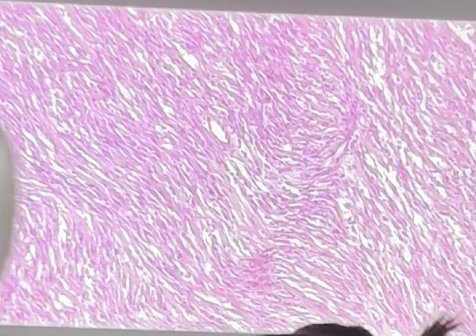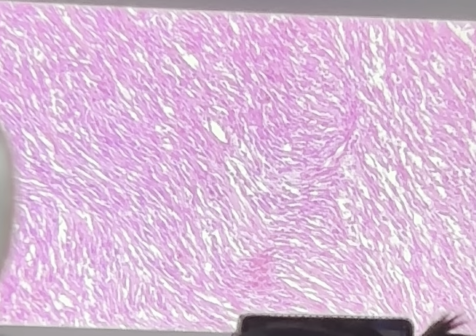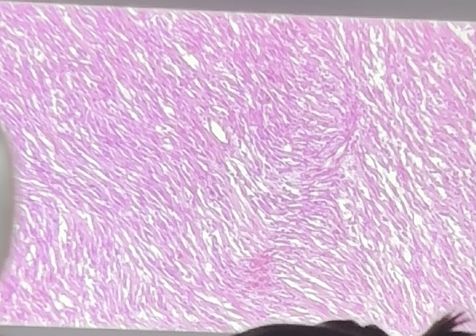But the problem with fibrosarcoma is that it is a wastebasket diagnosis. Meaning, if you see this pattern, and the pattern is called a herringbone pattern. Okay, a herring is a fish bone. It's a type of fish. So let's see if we can find a very ideal textbook picture of a herringbone pattern. Yeah, sort of, but it's not. Here.